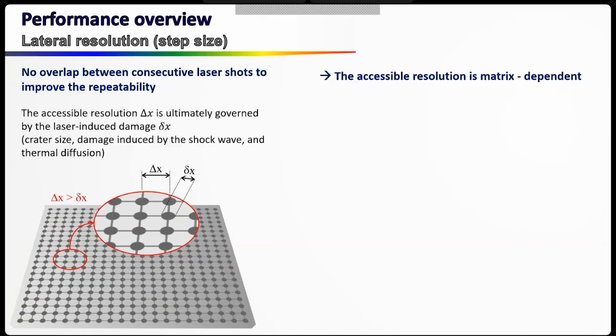And then this is maybe one of the, these 2 or 3 slides are quite important because you will see all the limits of this imaging technique. The first one is, if you want to consider the performance of this imaging, we have to consider the resolution, the sensitivity, and the speed.